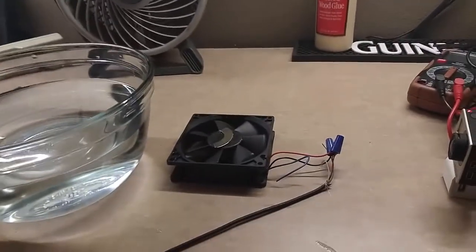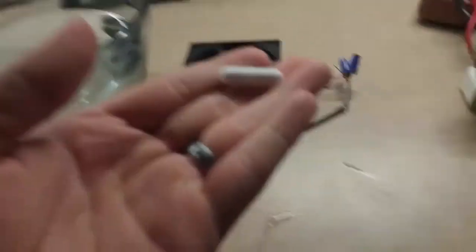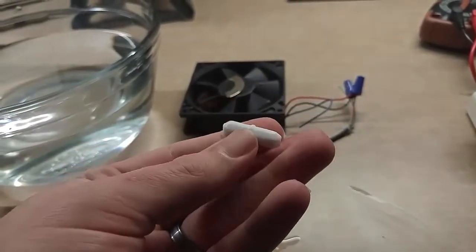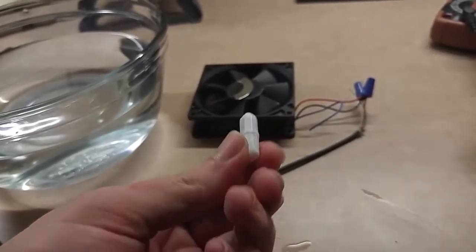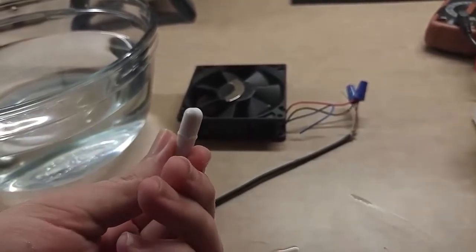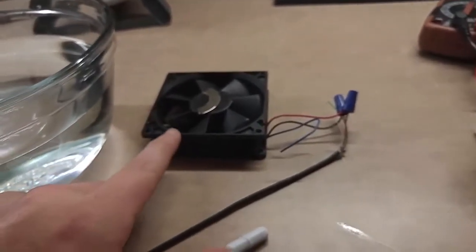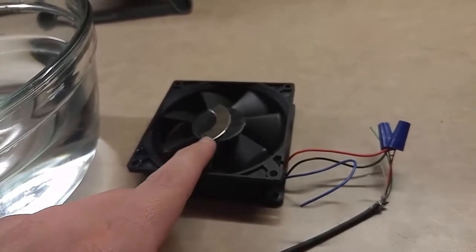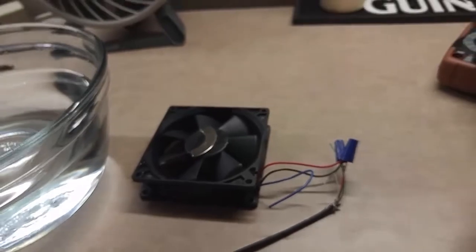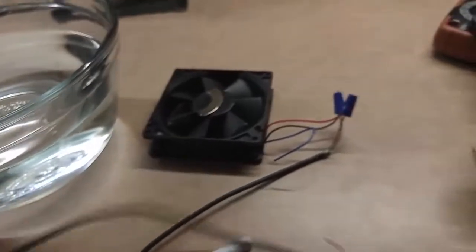Here it is. The only part I had to buy was this little magnetic stir bar — it's a little plastic thing with a magnet inside, covered in a food-safe, temperature-safe material, so no problem putting it into wort, beer, or whatever else you want to mix. The rest of it: I took a computer fan out of an old power supply, took a rare earth magnet out of an old hard drive, glued it on top of the fan, and I'm just using a USB cell phone charger for power, which is 5 volts.